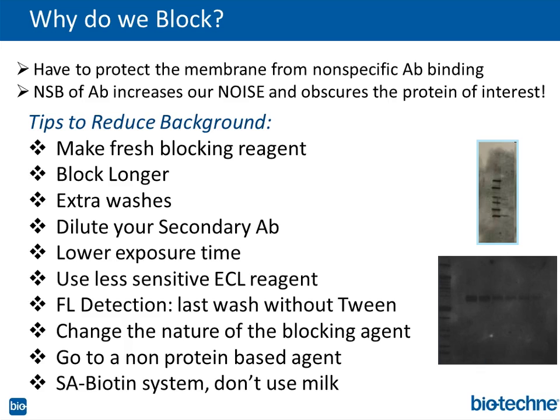So the first thing I'm going to tell you: if you've been using an antibody to p53 for years, the same antibody, and you've been using 3 to 5% non-fat dry milk and getting wonderfully low backgrounds, and then all of a sudden you're using an antibody against caspase-3 with the exact same 5% non-fat dry milk, and now you're getting high background. Well, you know what you do? You change the blocking agent. You don't have to be married to non-fat dry milk.